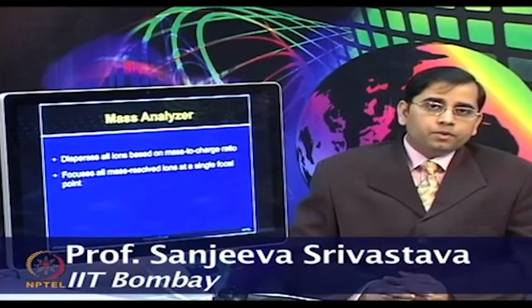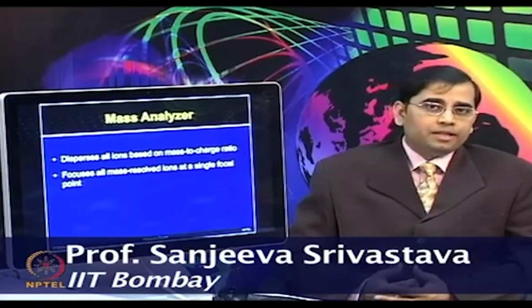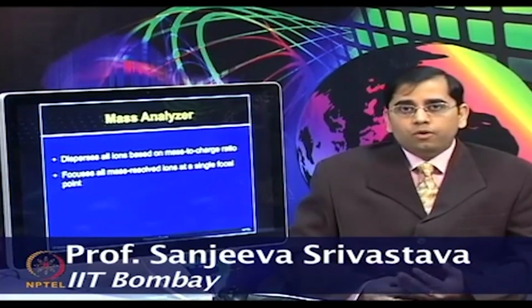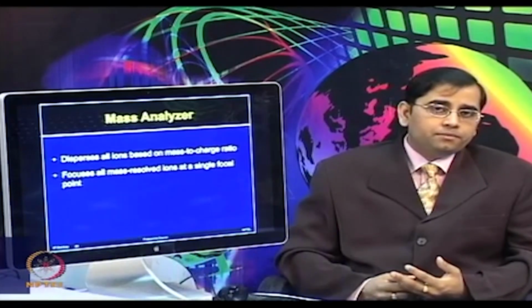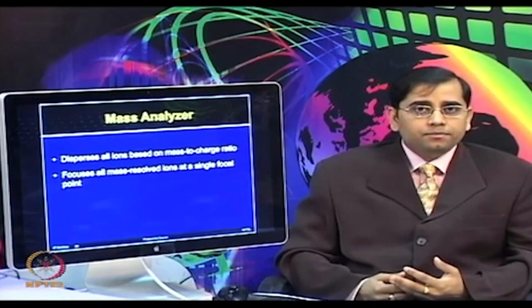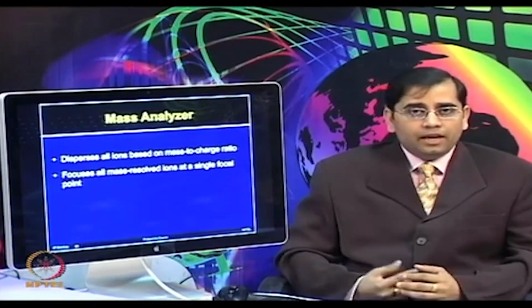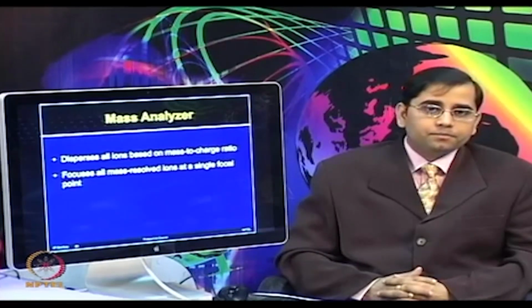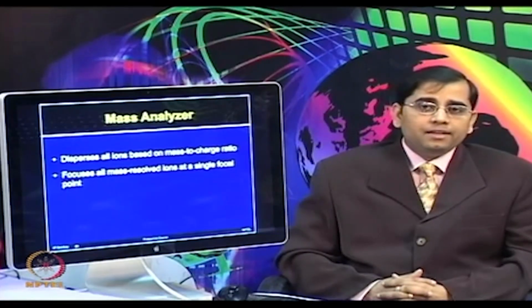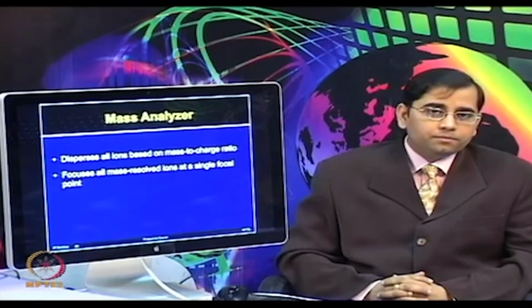So, we are talking about an MS experiment and I am trying to give you an overview of the various steps involved. First of all, we looked at liquid chromatography based pre-fractionation, in-gel digestion, and different types of ionization sources, and now let us move on to the mass analyzers. A mass analyzer plays two most important functions.